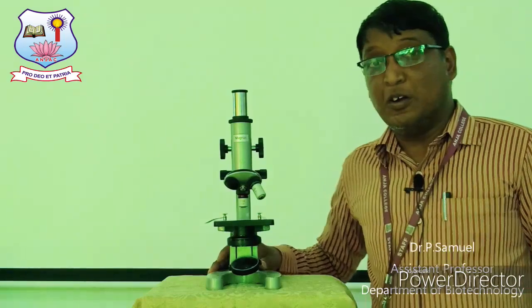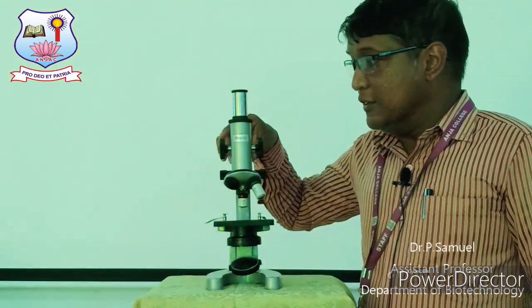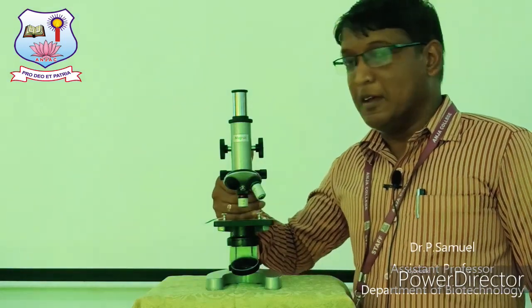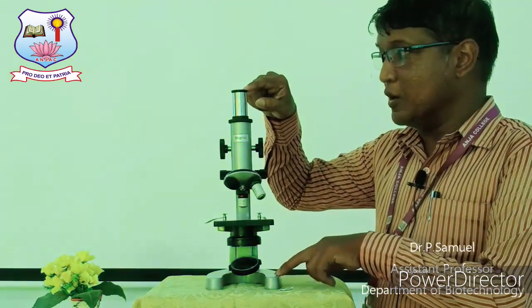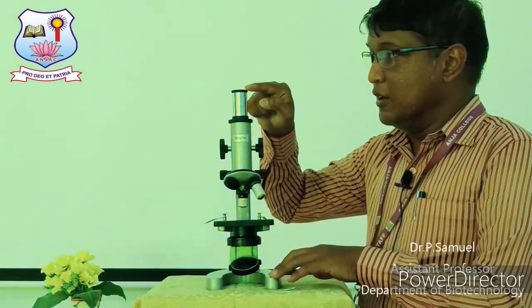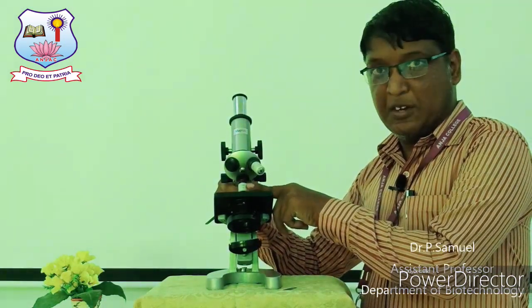The one you are observing here is a compound microscope, and this is otherwise called a student microscope. This common version of microscope is very essential for all microbiology-based experiments, right? Let's see the parts in detail. This is called the eyepiece. As I told you before, this is a compound microscope because it contains more than one type of lens. One is called the eyepiece. The other one at the other end is called the objective lens.